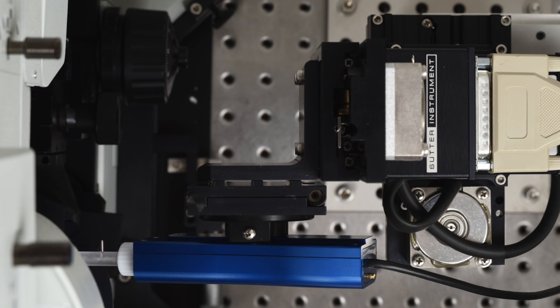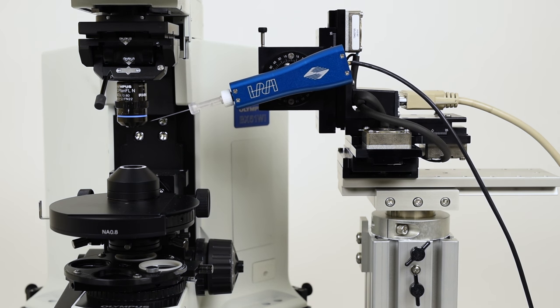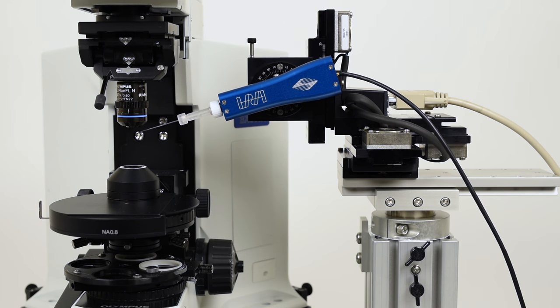The right angle adapter will give the manipulator an added one and a half inches or about 40 millimeters of added reach. This allows you to move the manipulator farther away from the microscope and still be under the objective. By turning the manipulator 90 degrees, it is now free to operate without obstructions in its path.